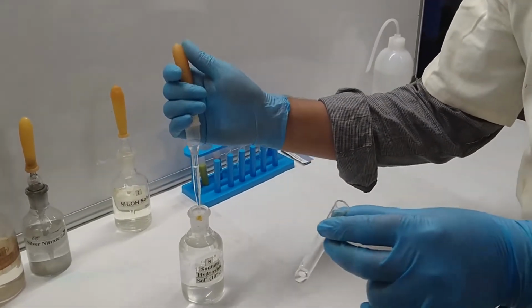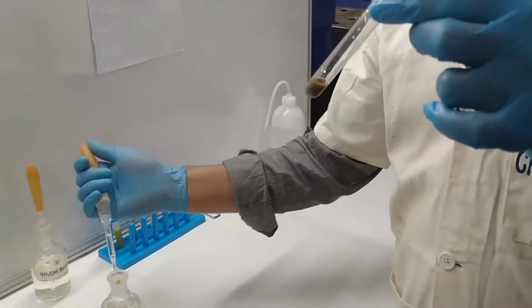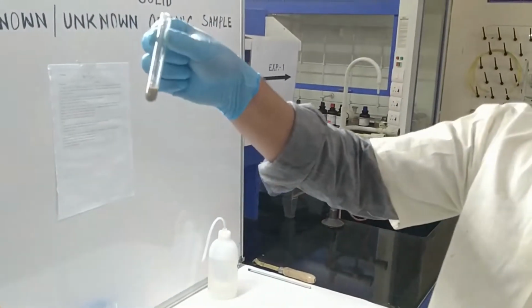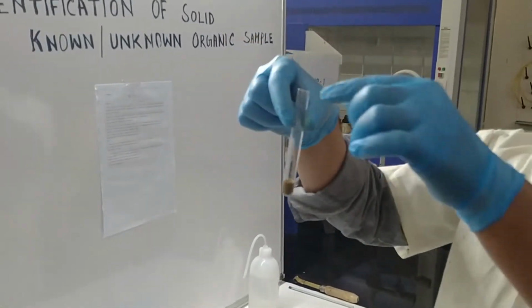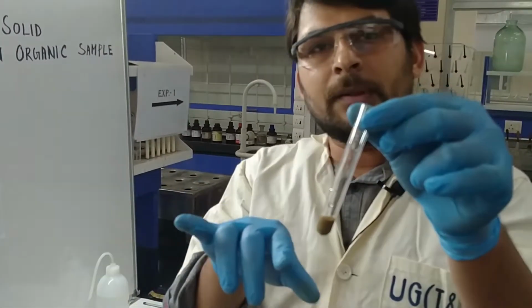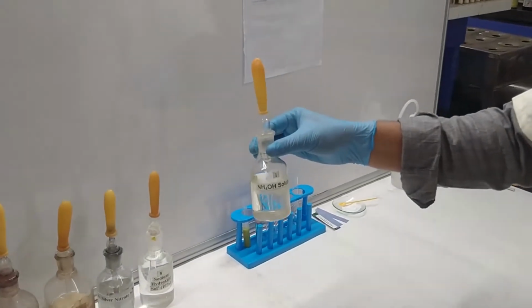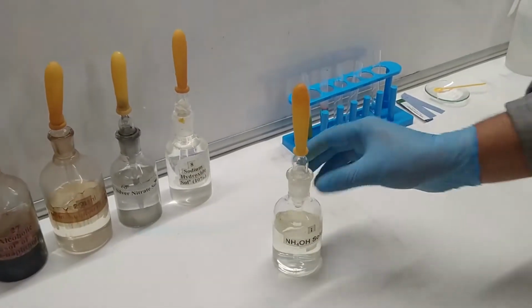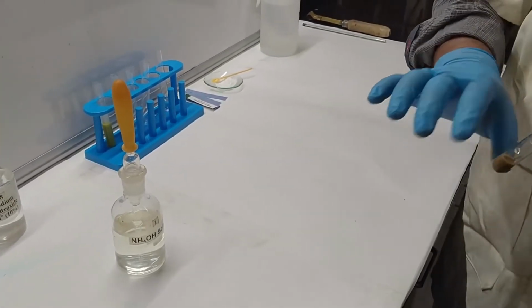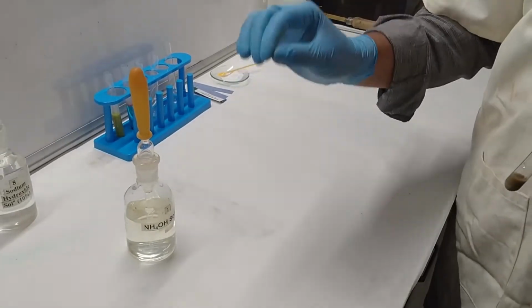See, the color appears over here. Okay, so this is a precipitation actually, so we have to dissolve this precipitation using NH4OH, ammonium hydroxide. Okay, so here is the ammonium hydroxide. I am going to add the ammonium hydroxide into this to dissolve this precipitation, and I am going to add this one drop by drop.